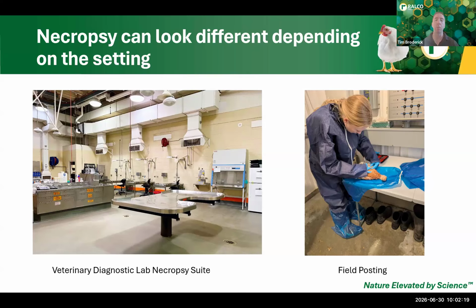And then we also have what we're going to be discussing a little bit more today, which is that field posting. While not necessarily as clean and pristine, it still provides producers and technical staff with quick available information that relates to the general health and performance of a flock, as well as a basic frontline understanding of what potential diseases or challenges a flock is experiencing.